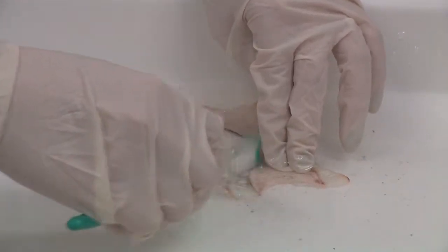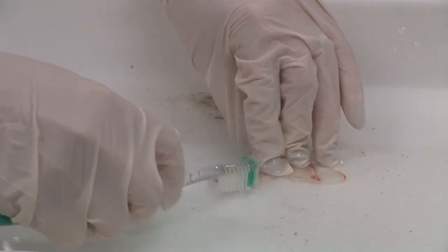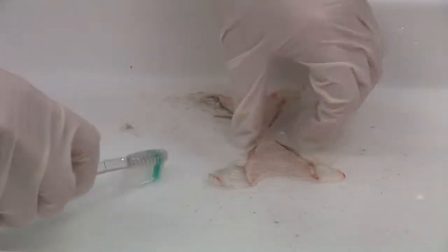The section will look dirty after the cut, but the majority of this can be cleaned up with some distilled water and a soft toothbrush. Gently scrub the dirt and loose particles off the vertebra before imaging.